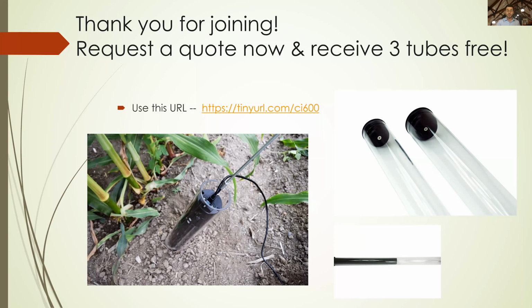The next question is, how much faster is the 602 compared to the 600 at the same DPI? In trials, it's actually been about twice as fast. We found it's a little slower when it's cold, but it moves at a much faster pace than the older 600s. Actually, more updated 600s are moving faster, but as technology increases in one, it increases in the other.